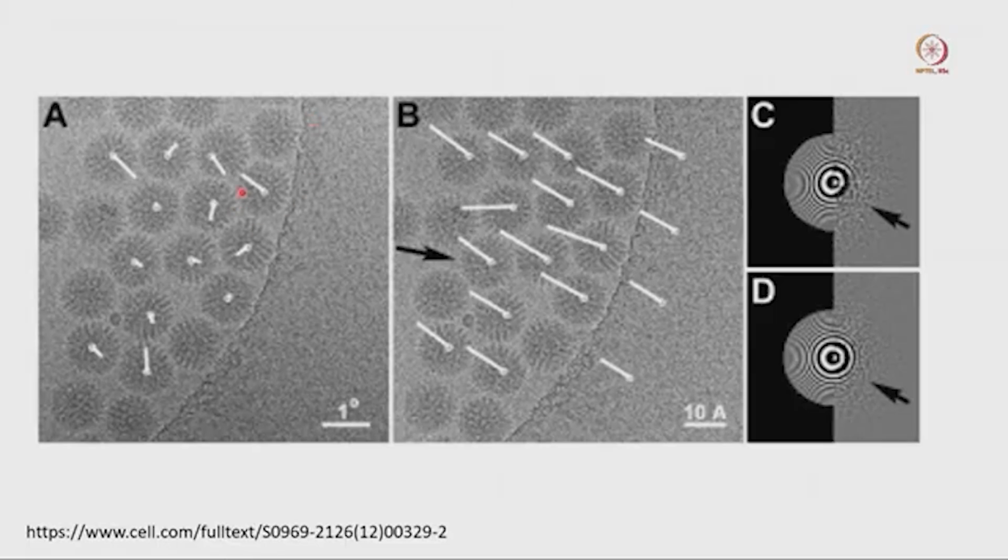So you can see it here, some part is carbon, and these are the ice area where virus particles are embedded. Now if we are targeting individual virus particles, we can see some of the virus particles are close to the carbon. Some of the virus particles like this one, this and this have a higher motion, where those two virus particles have almost zero motion.